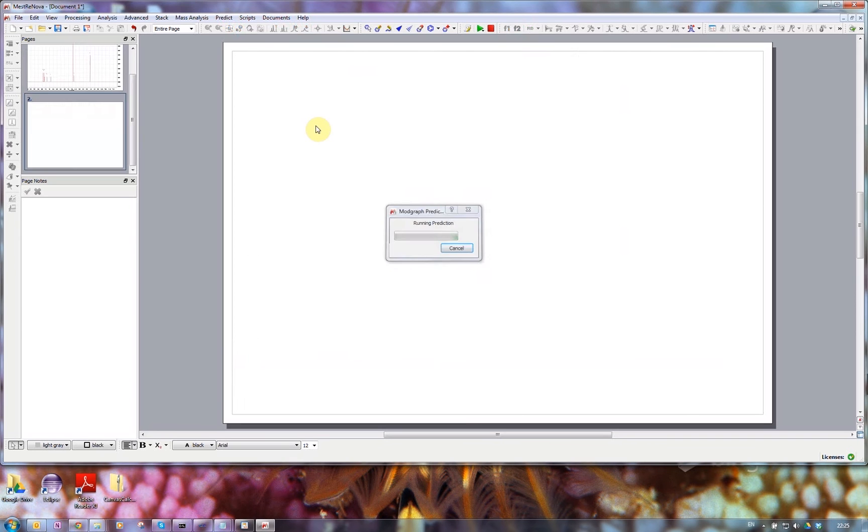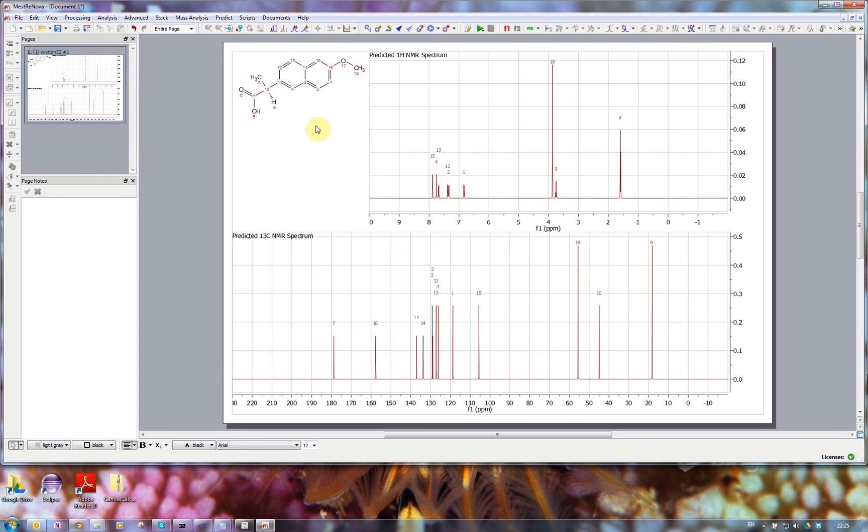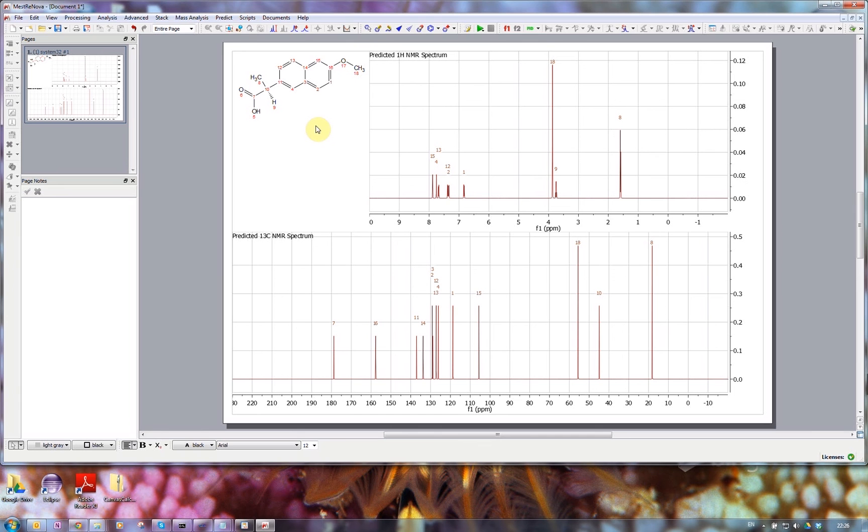And it's doing both a proton and carbon-13 NMR prediction. Hardly any code in this add-in, very nice and easy one to write. Don't know why I didn't do it sooner, but there you go, that's it.